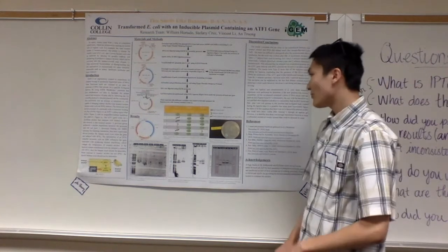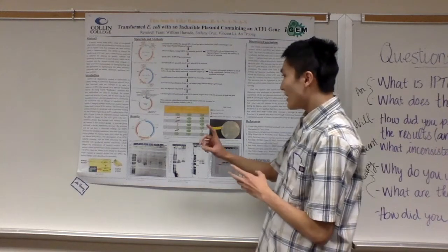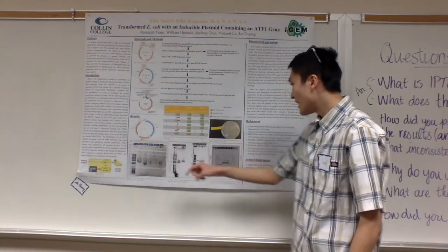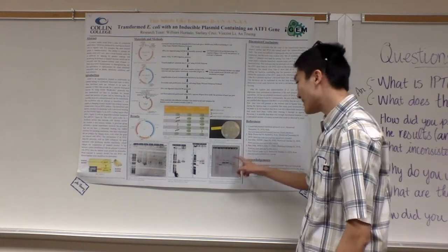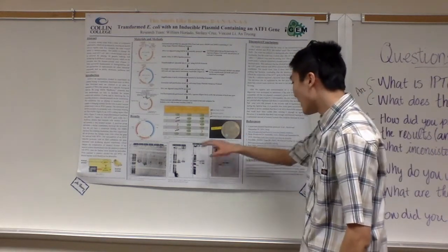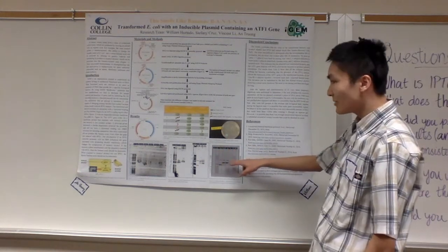One of the very interesting things that happened was that our plasmid is supposed to be around 4,000 base pairs, but when we only linearize the plasmid with 1 cut in either EcoRI or PstI, it turns out that the entire plasmid, or most of the plasmids, turned out to be around 2,000 base pairs.